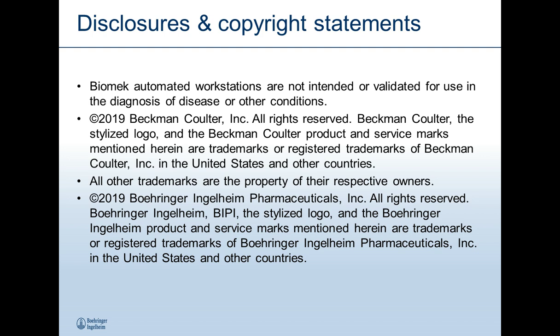When it comes to setting up liquid handling protocols around some of these assays, the best advice I can give, especially for novice users, is don't overthink it. If the thing you need to do is add a reagent to a plate, it's a simple single reagent transfer.